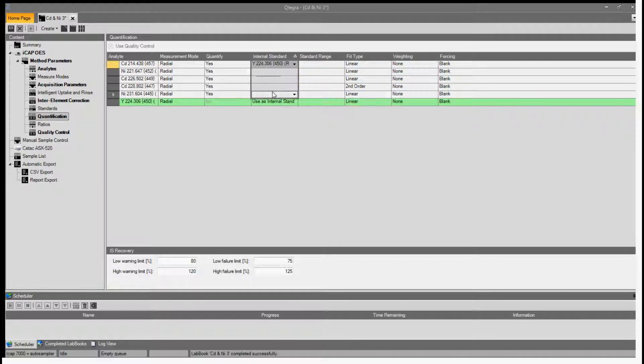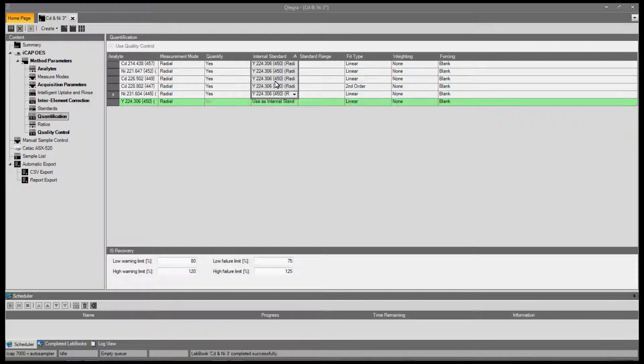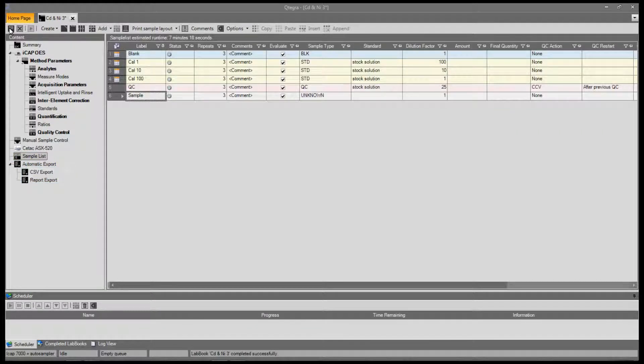Then use the fill down feature to complete the block. Now create your sample list, press Save and OK.